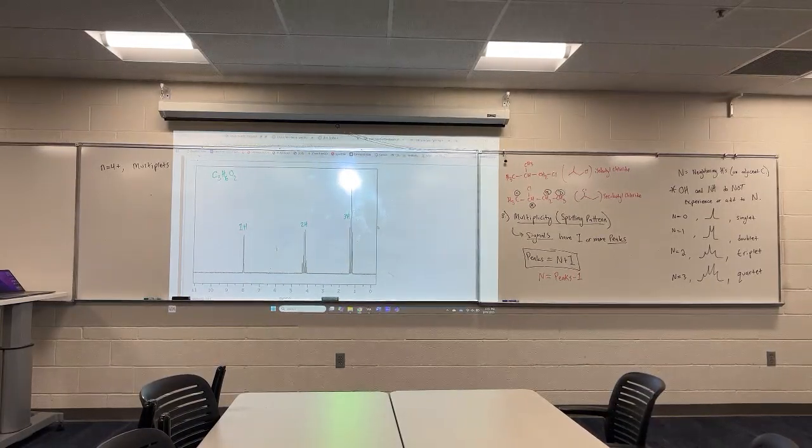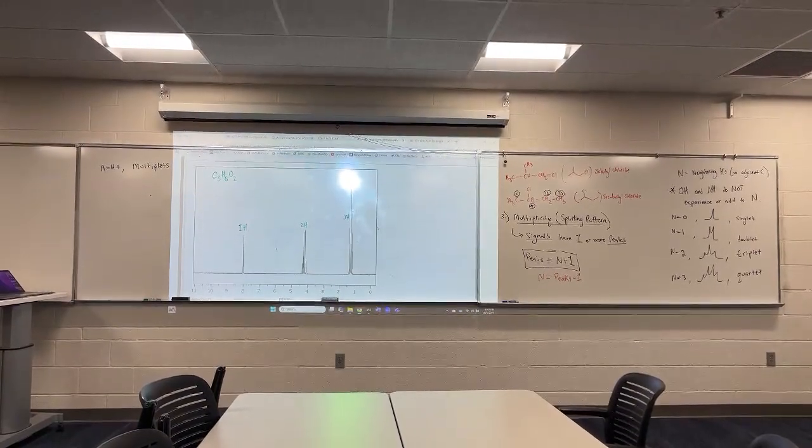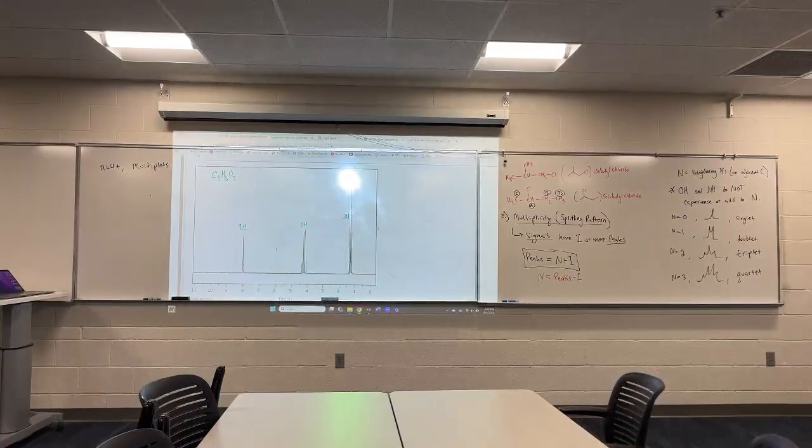Well, from this idea, this is what we got from that earlier one. But do you really think there's potentially 2 CH3s in this molecule? No, I agree. I think there's really only a chance for 1 CH3. So it seems more like these are the groups we got, right? And this, because there is a 2H signal. And now we got to try and figure out how these connect.